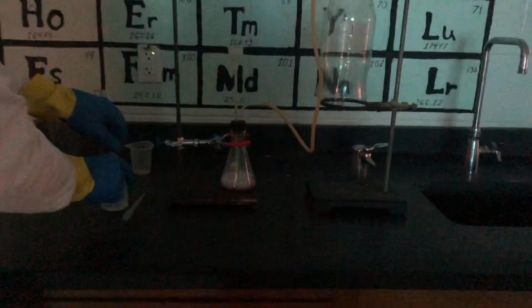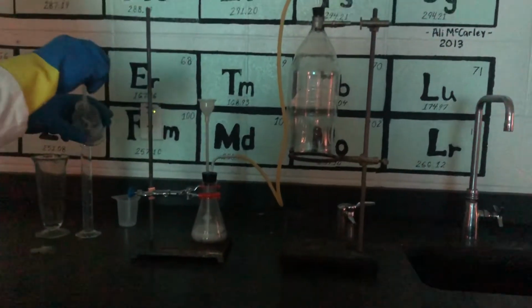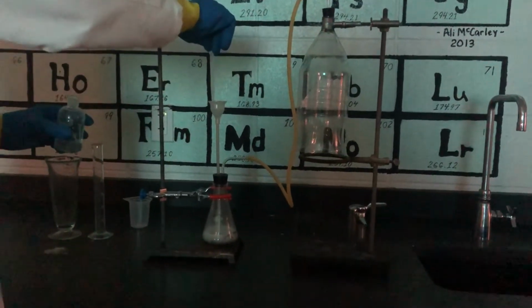Looks like we've still got some bubbling going on there. I'm going to add just a little bit more acid to continue the reaction. As you can see, it's bubbling nicely. Still adding it. Adding hydrochloric acid to the thistle bulb.